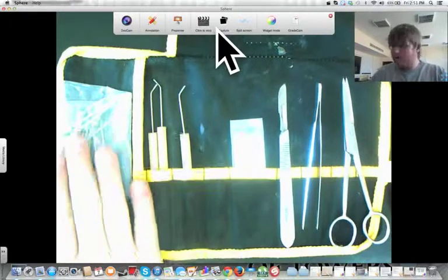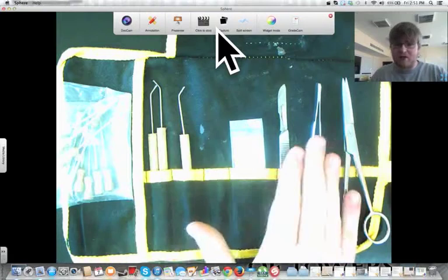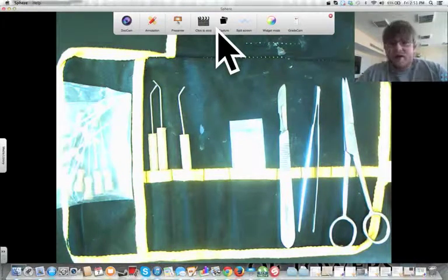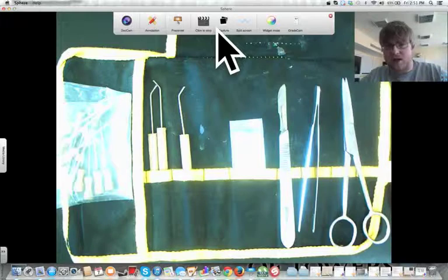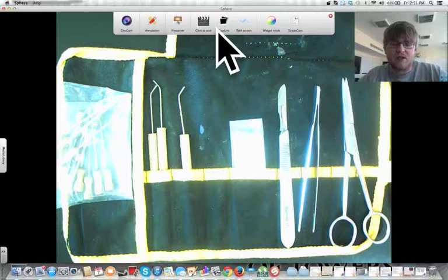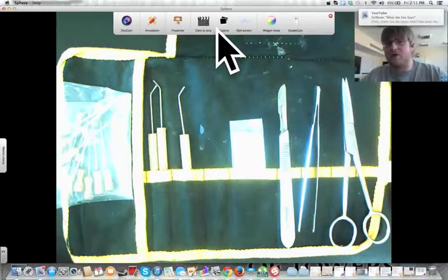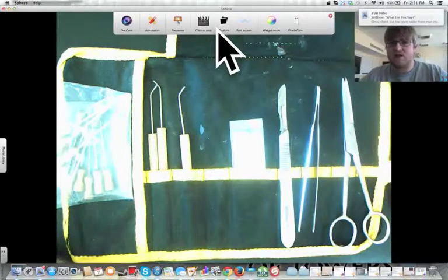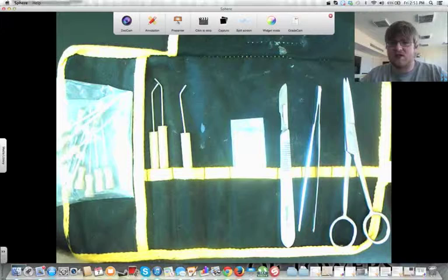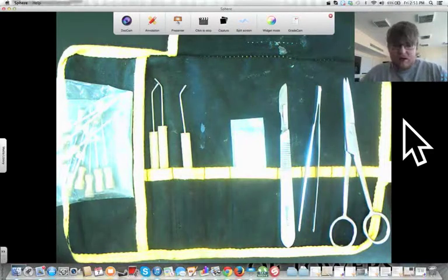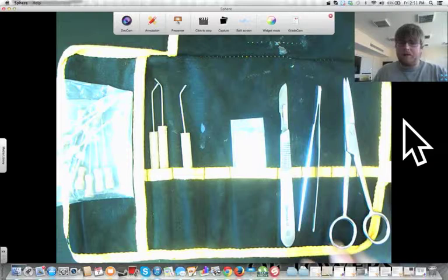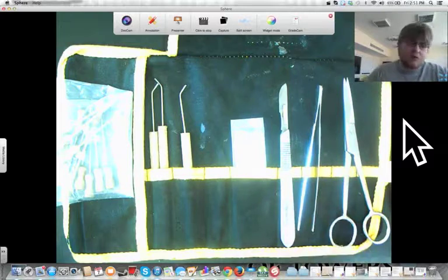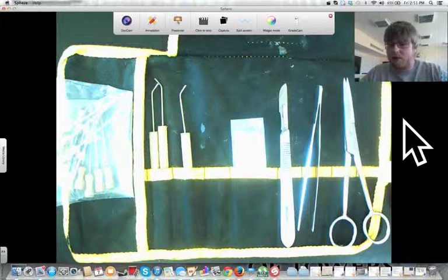Dissection probes and the tweezers are both used for similar purposes. They're used to manipulate things in your dissection. The advantage of using the probe or the tweezers is that they're smaller than your fingers, so you still have an ability to see them easily or see your dissection easily. It also makes sure that you don't accidentally crush something while you're moving it around.